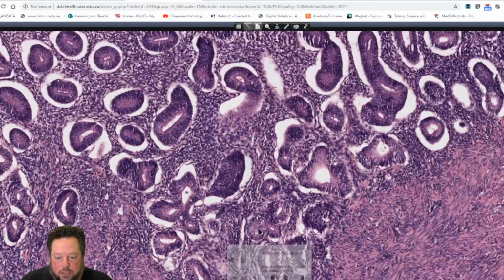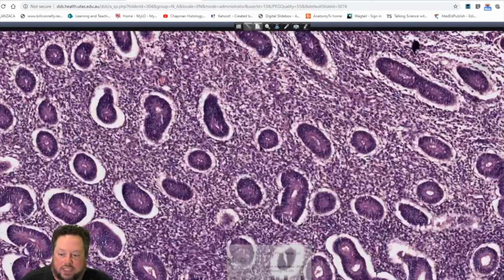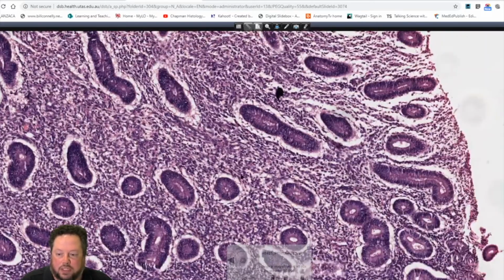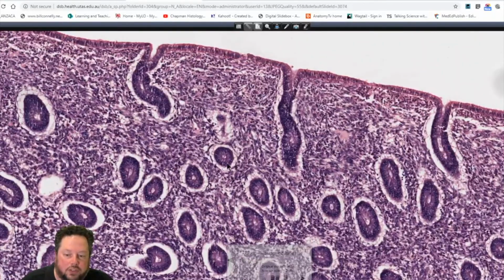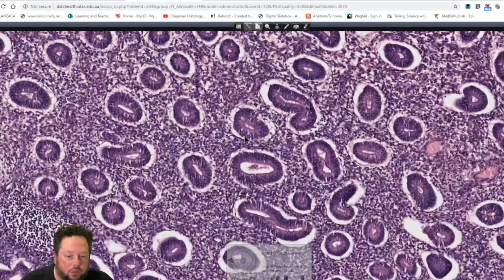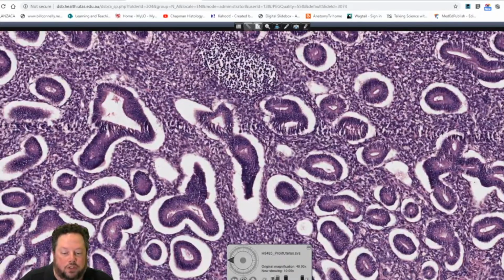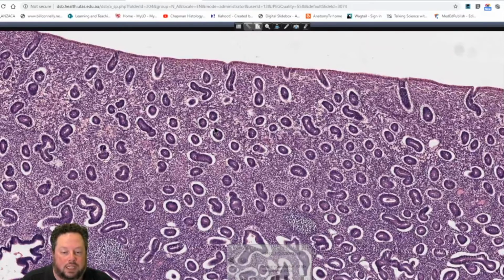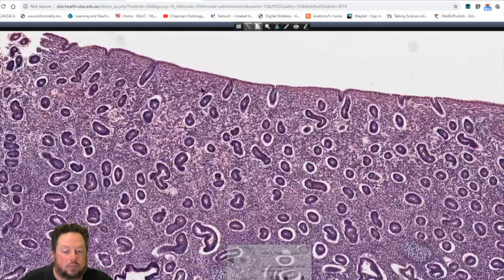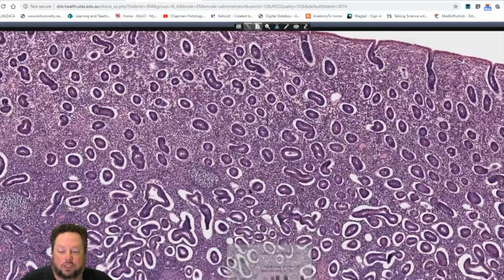If we zoom along a little bit, they're not always that easy to see. We can actually see some blood cells here, but I don't really see a lot of evidence of arterioles that I can point out, unfortunately. But generally speaking, the majority of the glands are simple, straight tubular glands, so cutting in cross-section, a round appearance, and you can see these straight lines here, very typical.